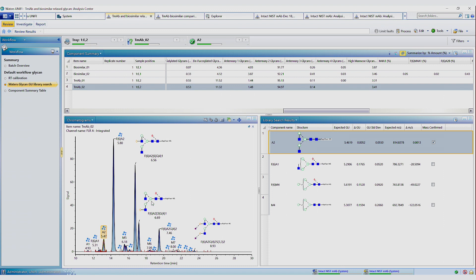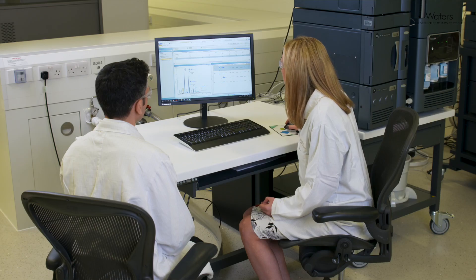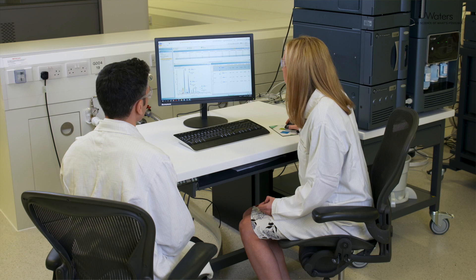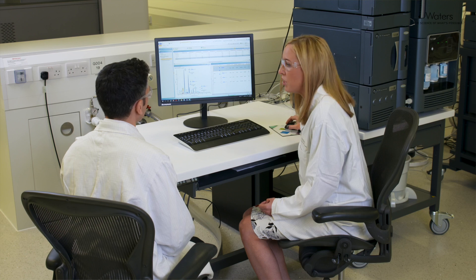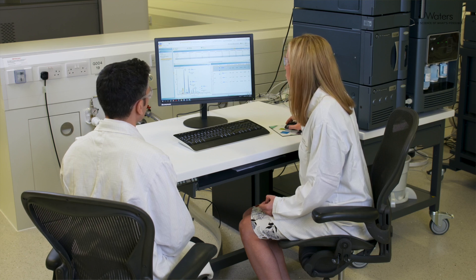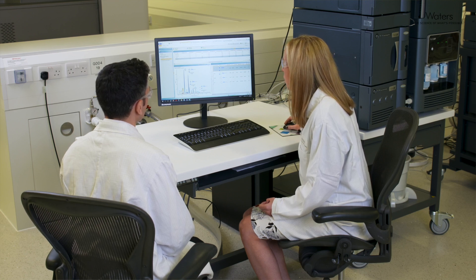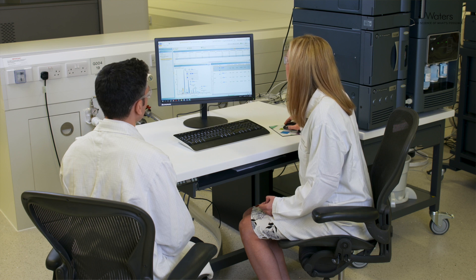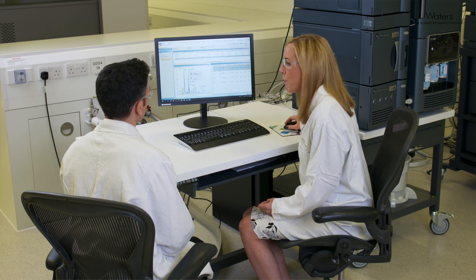Okay, and again, we have the glycans from trastuzumab. So the way in which this workflow works is by determining the GU value from the dextran calibration. The GU value is then used to search a library.